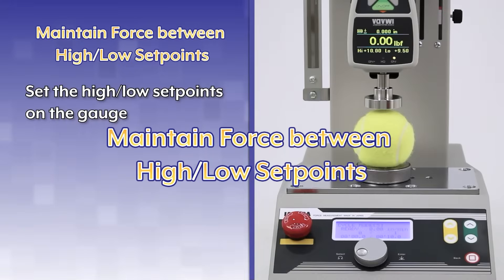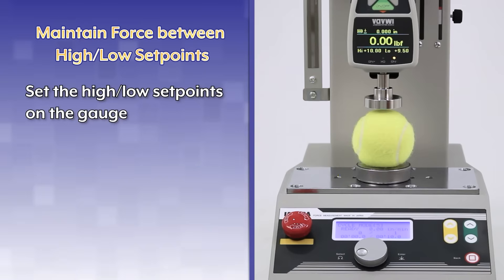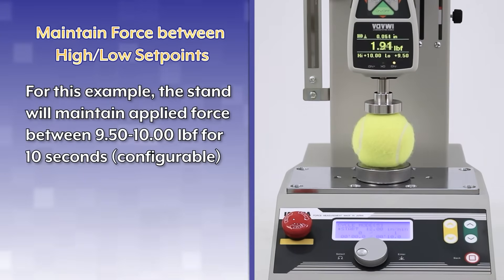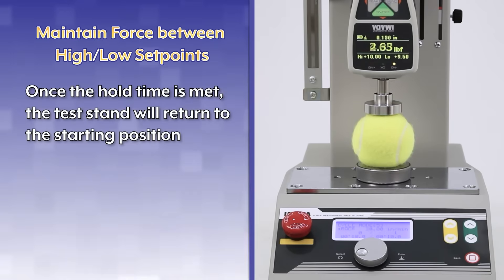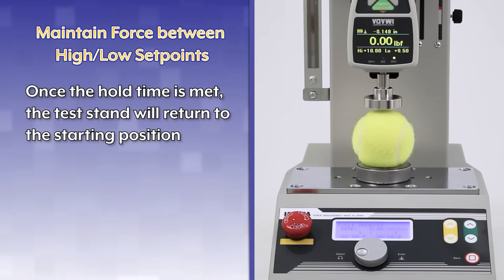Maintain force between high-low set points. Set the high-low set points on the force gauge. In this example, the stand will maintain applied force between 9.5 and 10 pounds force for 10 seconds, configurable. Once the hold time is met, the stand will return to the starting position.